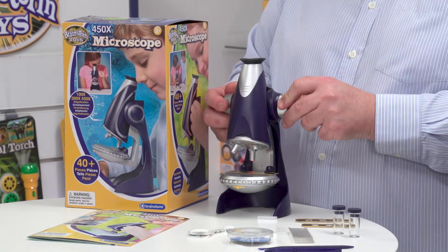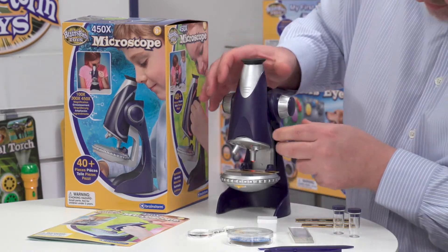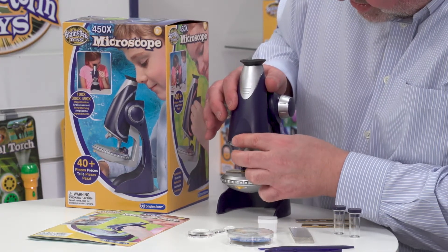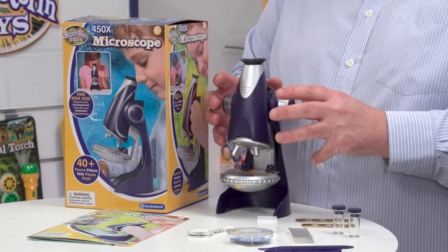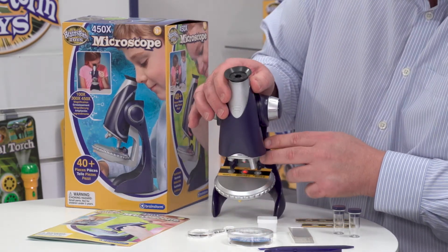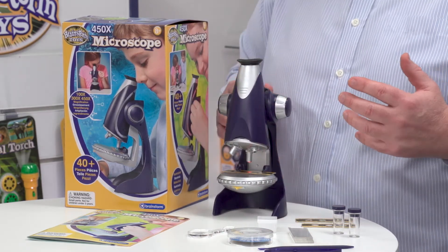You'll notice here we've got a dial that moves the microscope up and down so you can bring the sample into focus. We'd always start with the 100 times magnification — get the image into focus first on 100 times, then you can switch up to 300 times by rotating here, and then once you've got it in focus you can move up to 450 times. So there we go — this is the 450 times microscope from Brainstorm Toys.